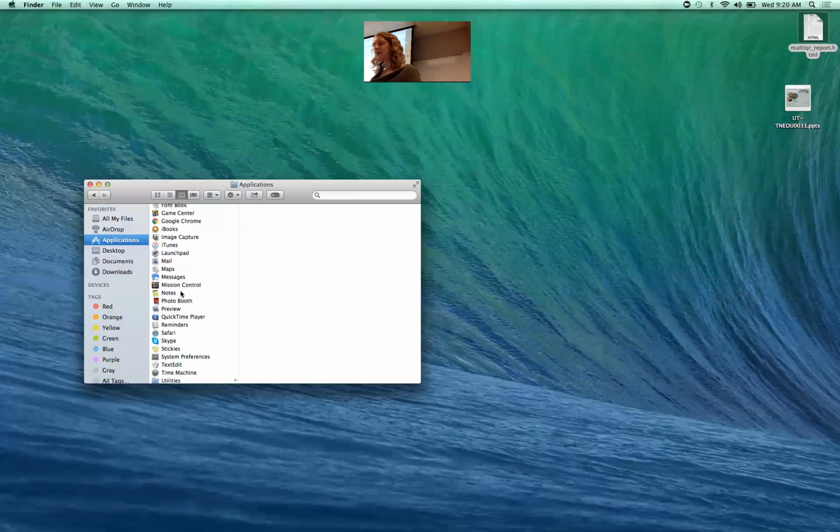All right, so while people are working on that, I am going to show you WinGene's data, because I think this is exactly what you want to see when you run FastQC and then multi-QC. She has 32 samples, and so it's a lot more convenient. Instead of us trying to click through 32 FastQC files, and they're paired, so it would actually be 64, it would be really a lot to look at all of them. Instead, it's going to conglomerate or aggregate the statistics so you can do comparisons.